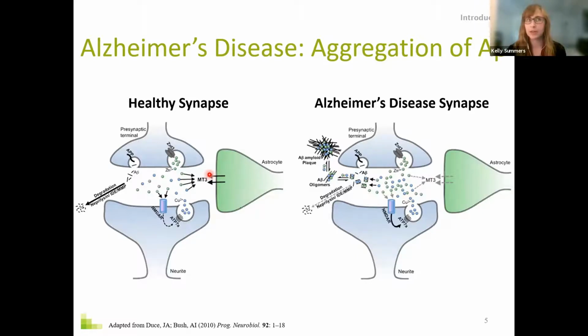Luckily, in the HERFD spectra, we're just collecting the near edge region, so those scans are only a couple of minutes long. And so we're using a very small beam, and we were actually able to collect at even more points across the sample. Okay, good point. So you just have to raster more. Okay. All right, good. Next question.